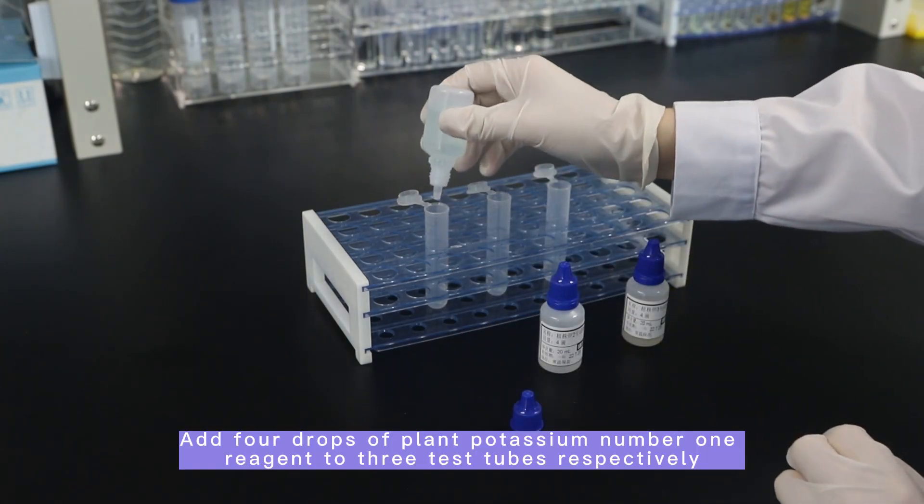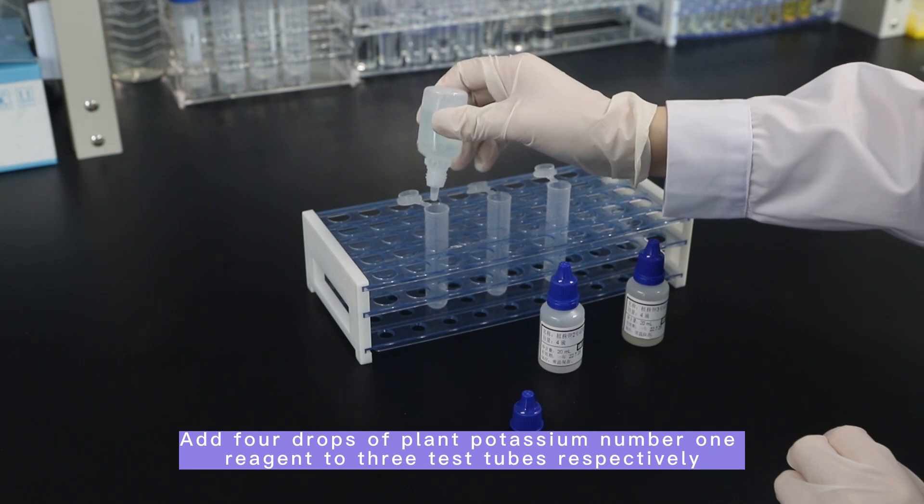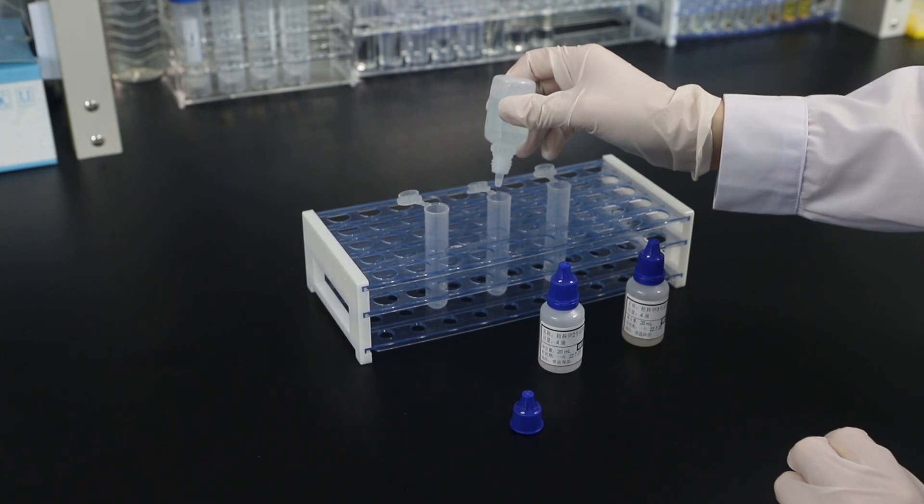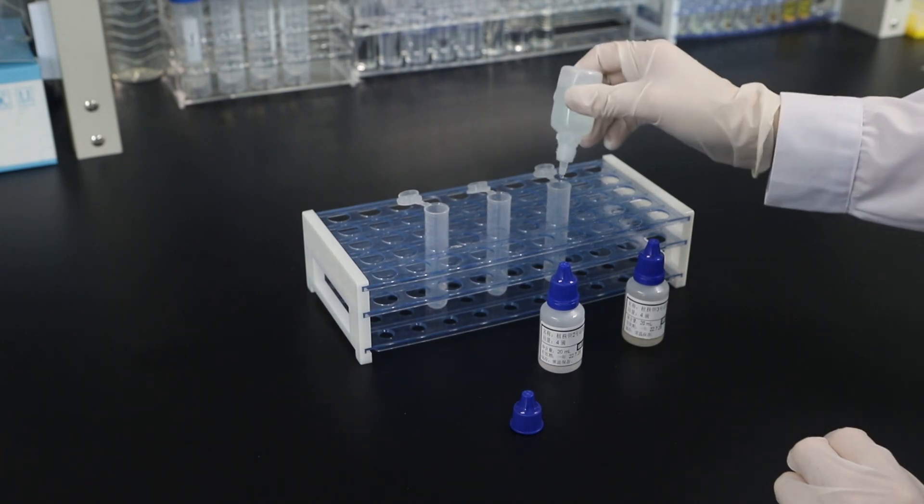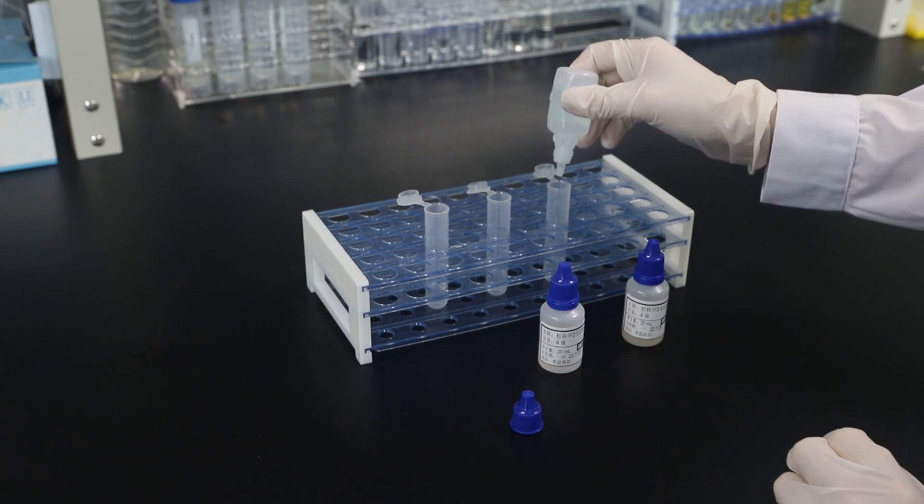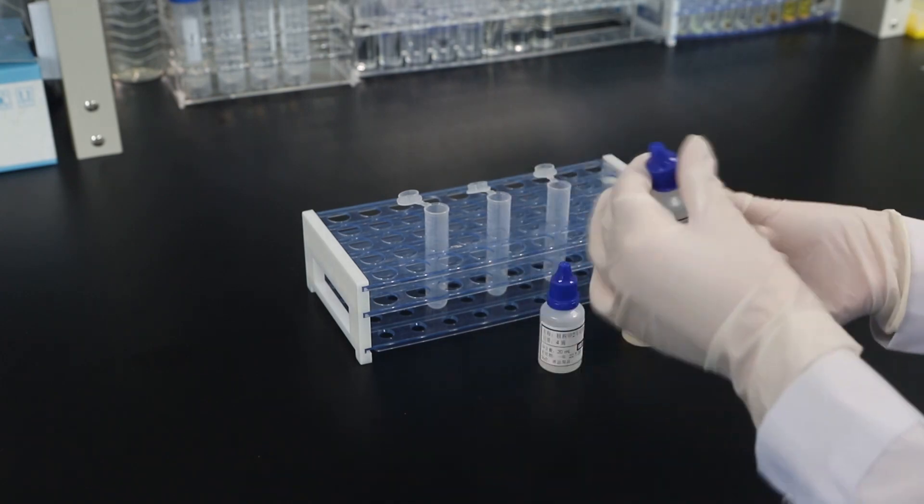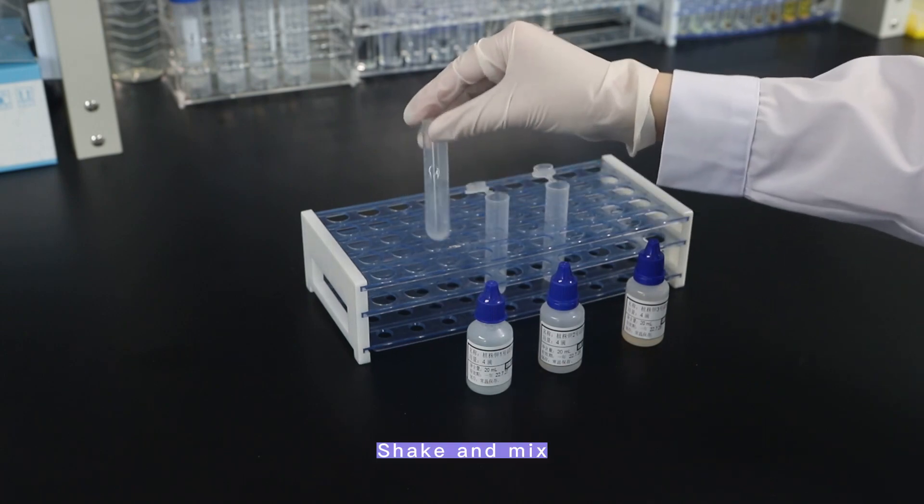Add four drops of plant potassium number one reagent to three test tubes respectively. Shake and mix.